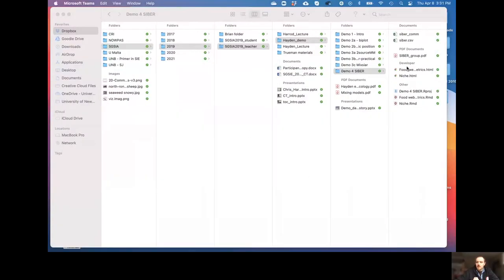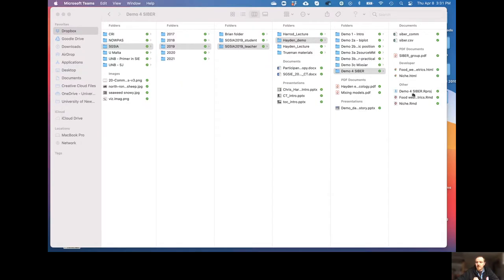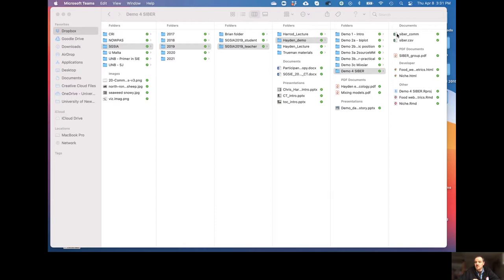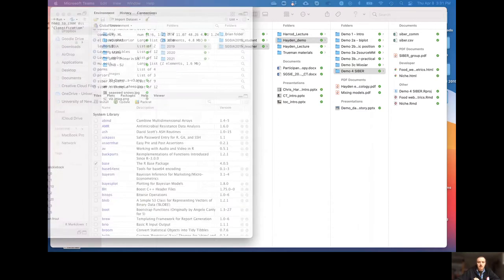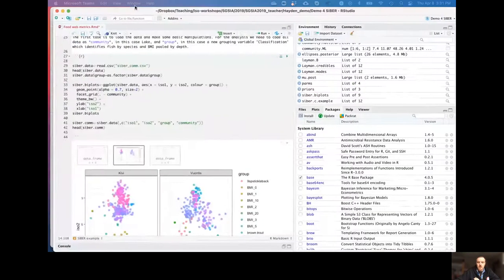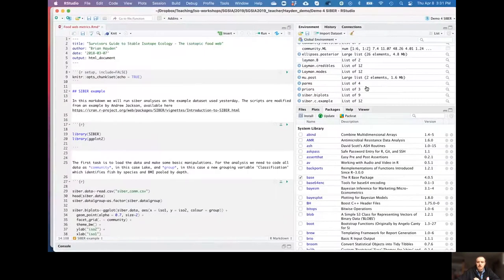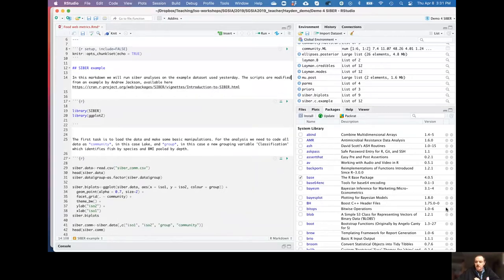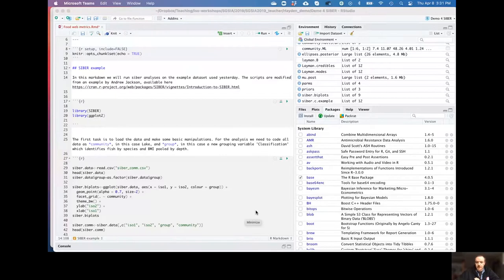Okay, so as before, I think I mentioned this last time, we're going to work with the same R project within the same folder here. But this time we're going to run a different markdown file - we're going to run the foodwebmetrics.rmd, and we're going to be using a slightly different input file up here, which is the siber underscore comm. So here's one I made earlier.